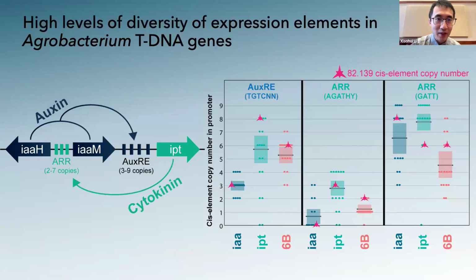Yes. Great. So I don't know when I cut out, but the basic idea is that naturally agrobacterium strains probably are manipulating the auxin-cytokinin ratio like we do in tissue culture. So one thing we're working on is, can we change that balance in addition to the 6B gene and create a suite of vectors that people can use across different species?